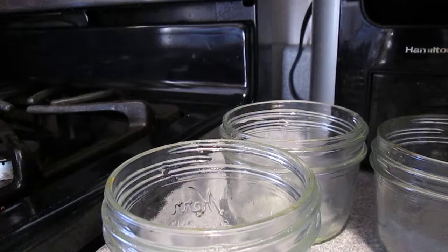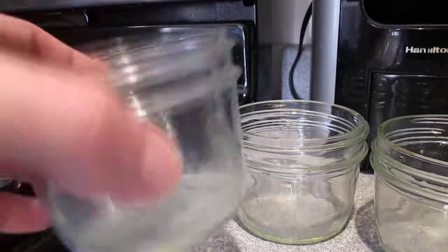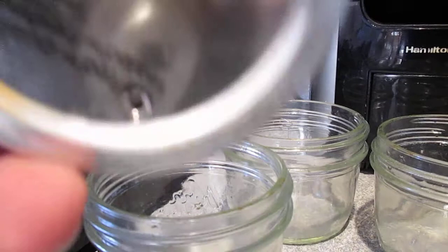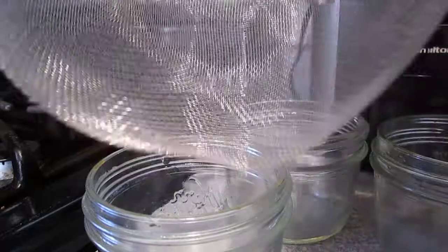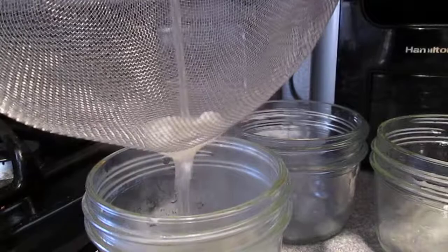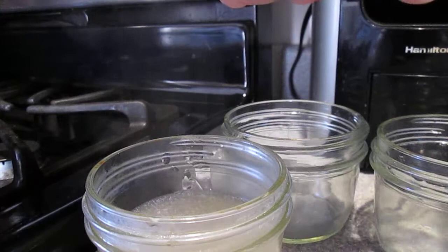It's been about 10 minutes since I've been cooking the agar and now I'm going to pour it into these half-pint mason jars. You'll see that the lids have holes in them — that's going to allow some air to flow while we're pressure cooking. I'm using this strainer here and that'll catch any of the agar that has clumped up. Filling about halfway on that one.